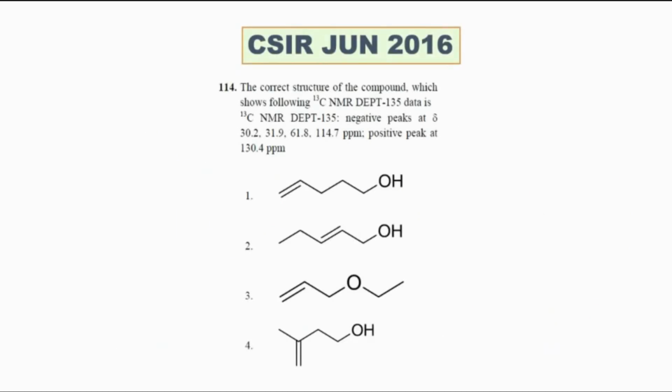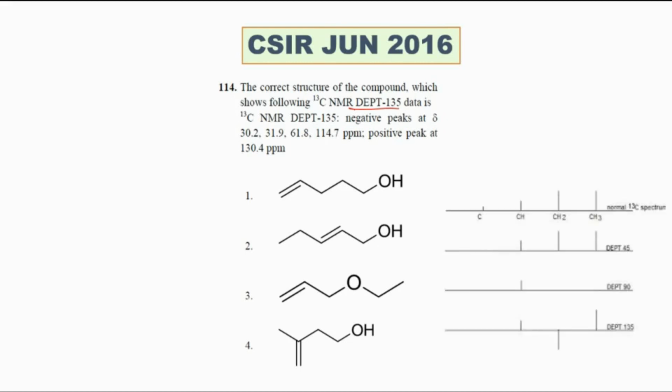They have solved a DEPT problem. So here, this is known as distortionless enhancement by polarization transfer. We don't need that much detail. The DEPT spectrum will look like this. So DEPT will be compared with the normal spectrum. In the normal spectrum, all carbons will come. Right? Then these are known as spin editing techniques.